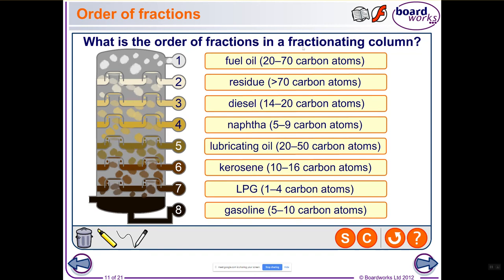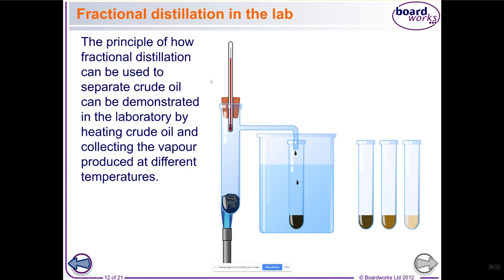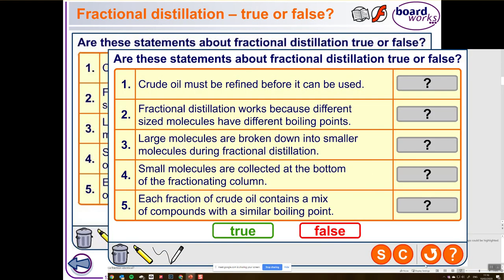What is the order of fractions? That's boring. Let's not do that. We can do this process in the lab. Normally, guys, I would actually do fractional distillation with you when we're in school, but of course, because of the virus, we can't go in. But if we get time when we come back, I'll try and squeeze a quick practical in for you so you can see it done in person. So I won't go through this too much now, just because we'll do it together.